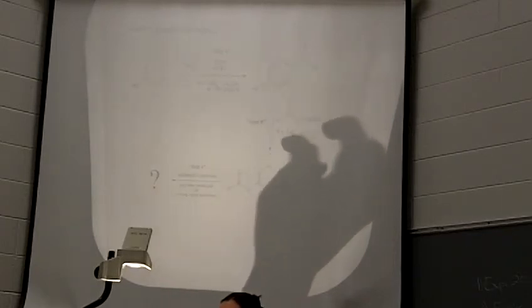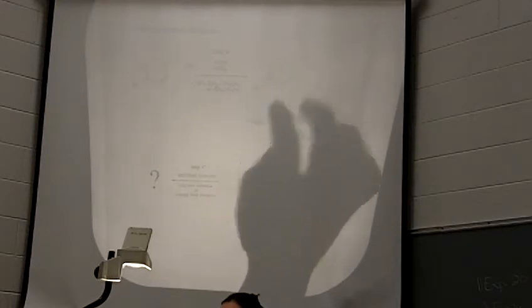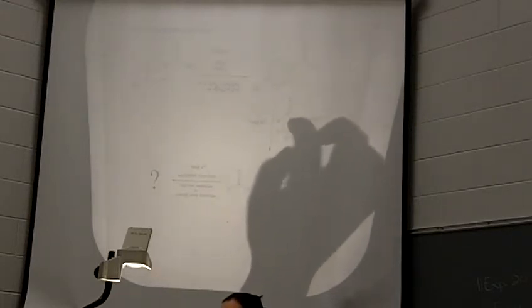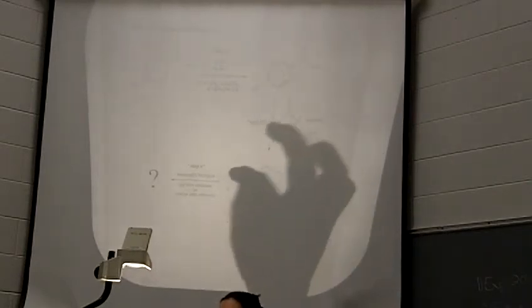In the second step, we then want to convert our phenol side using an acid chloride to an ester as well. So in the end, at the end of next week, you will have created a diester, all right?